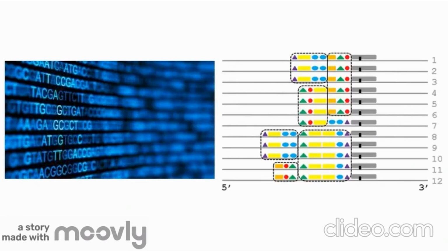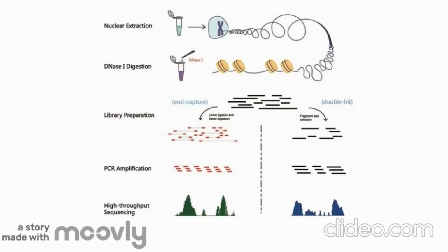A bioinformatic pipeline can then be employed to identify conserved transcription factor binding sites in these accessible cis-regulatory regions of the chromatin. The DNase Seq protocol typically takes about a week to get from a tissue sample to a ready-to-sequence Illumina library, run the sequencing machine, and do the basic bioinformatic analysis.